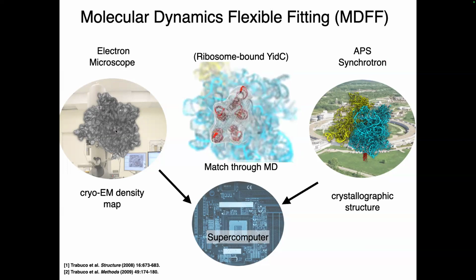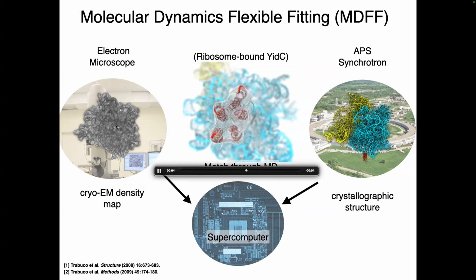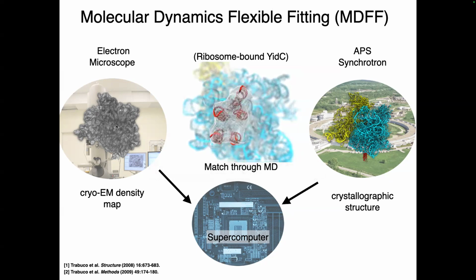Instead of just putting it there by hand and modeling it there, which is very tedious and very error prone, you can start with conformation A and, using MD simulation, gently morph it into conformation B, so it matches the density that you get from your new experiments very nicely. Instead of just pushing it there, you allow it, by running MD simulation, to relax other degrees of freedom of the system, put it inside the density and increase the cross correlation between the density and the protein.